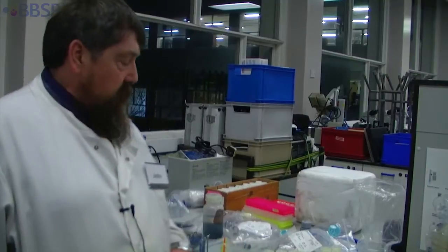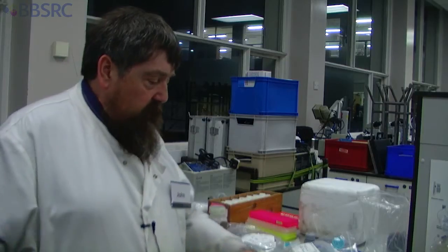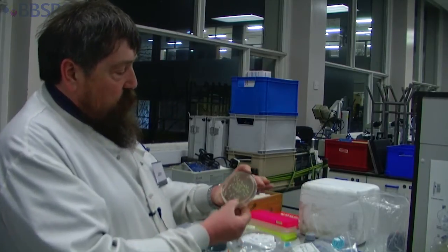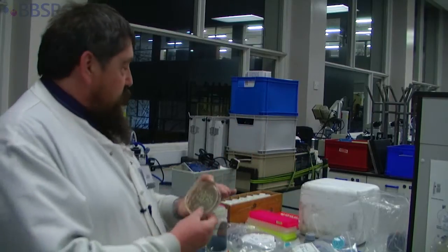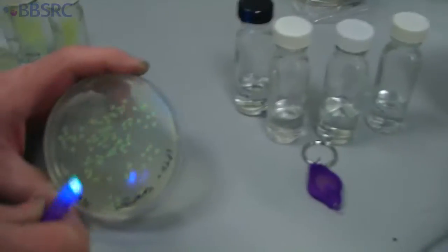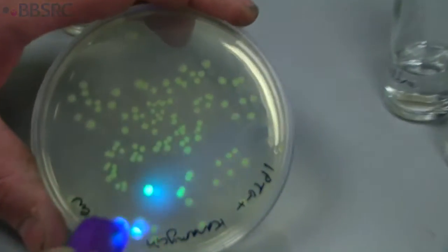The other thing we've been doing is to look at a transformation. My colleague and I have been looking at an alternative, which is this organism here — it doesn't look very impressive at the moment, but if I take a little UV light and shine it, you will see there'll be beautiful fluorescence.